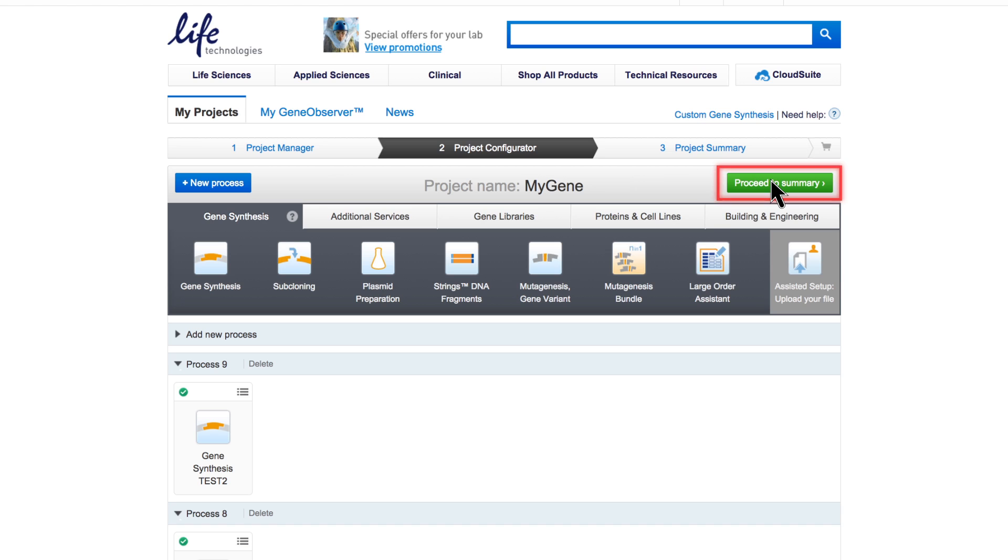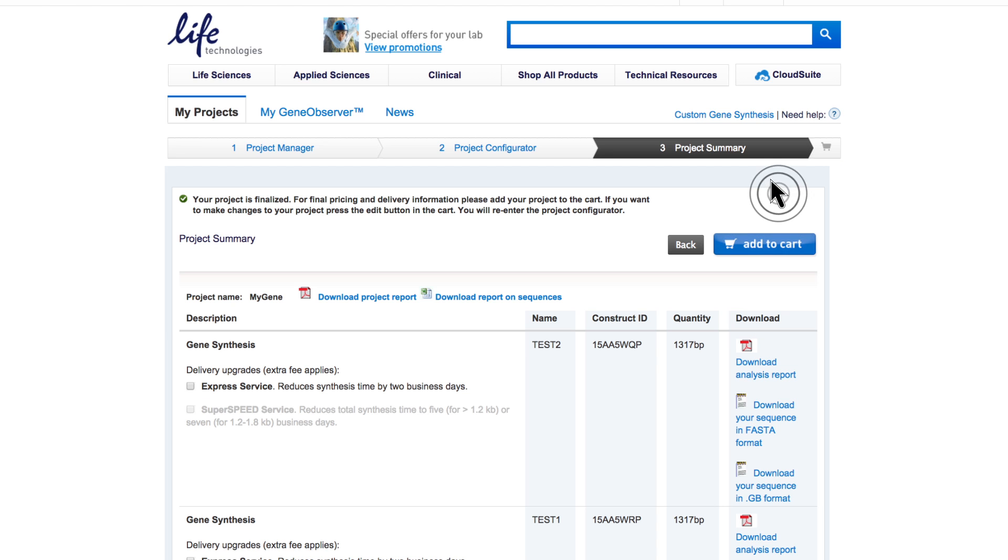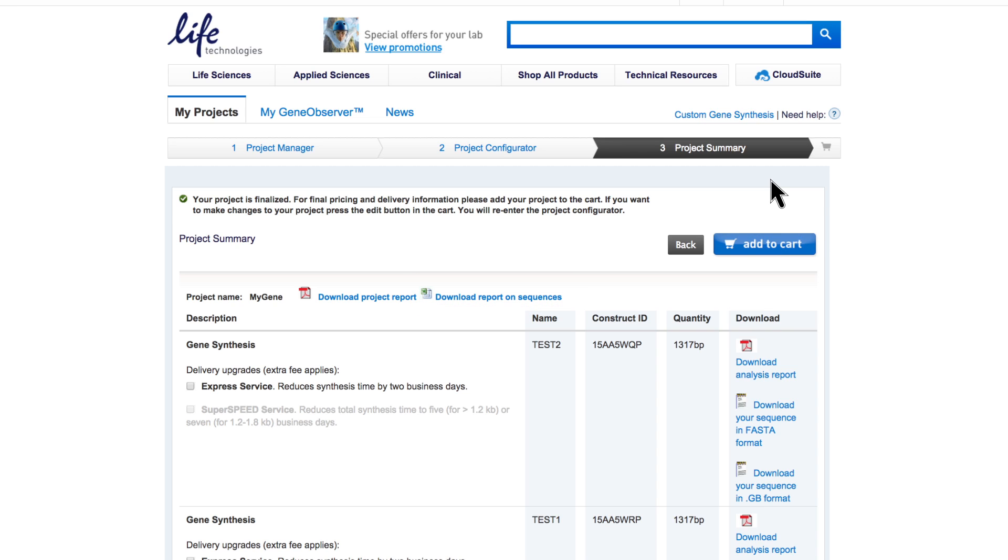Click Proceed to Summary. After proceeding to summary, please note the Excel spreadsheet. It summarizes your project, including all sequences. Check the correctness of all sequences before you add them to your cart for ordering. If available, you can select order speed upgrades here and receive your individual sequence analyses and sequences for download.